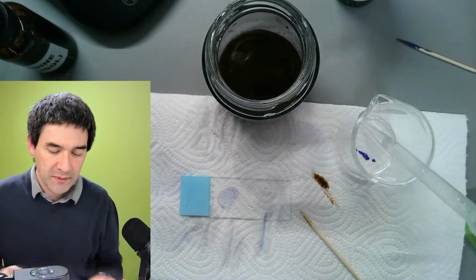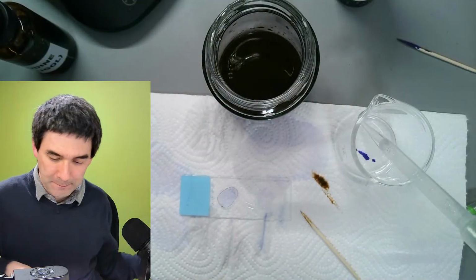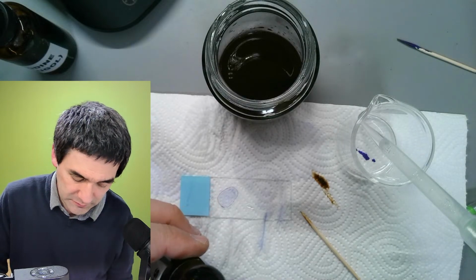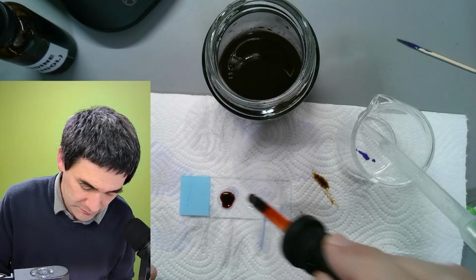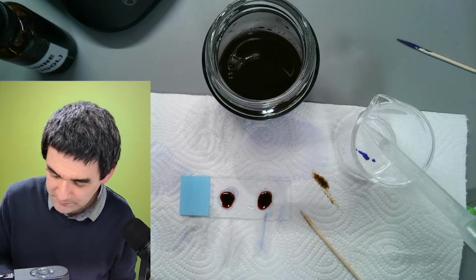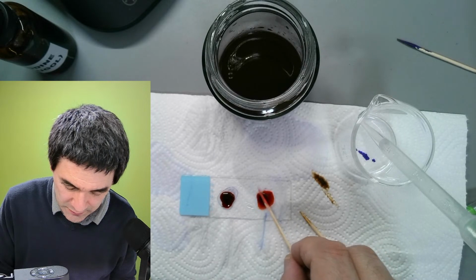This is the desk view. And the last step is counterstain for 1 minute, rinse and blot dry. Okay, so let's try this here, here and here. Let's spread it again a little bit carefully.